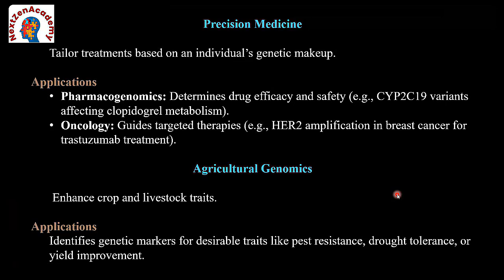Deletion means that in the reference position, AGT should be there, but in the samples it is only A. GT got deleted. That is called deletion. This is how genetic variations look.